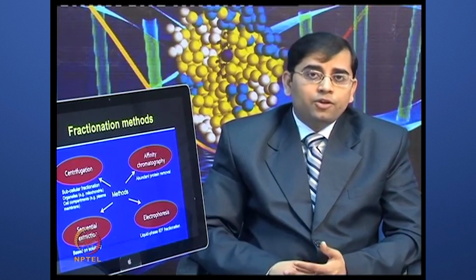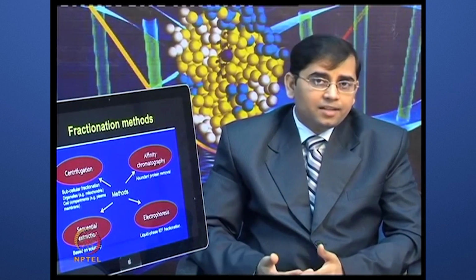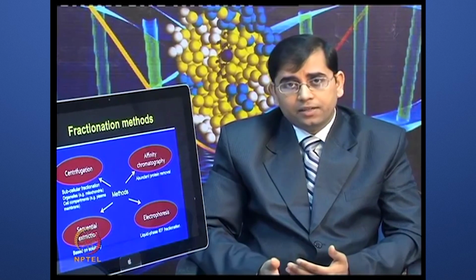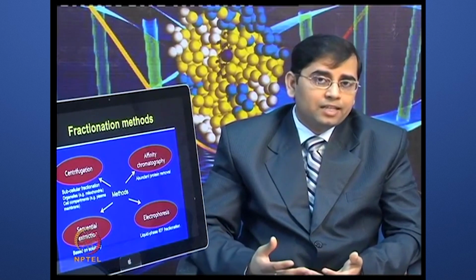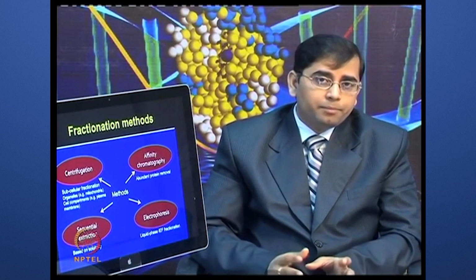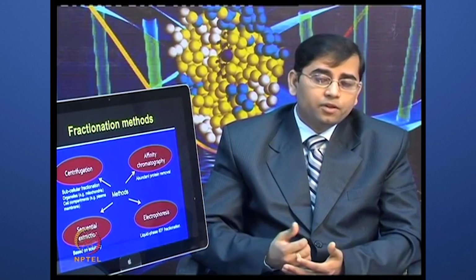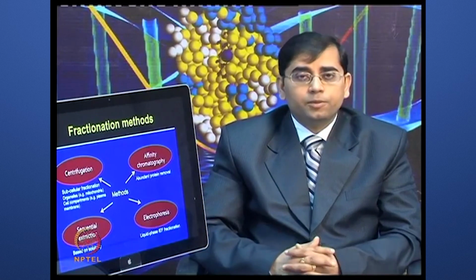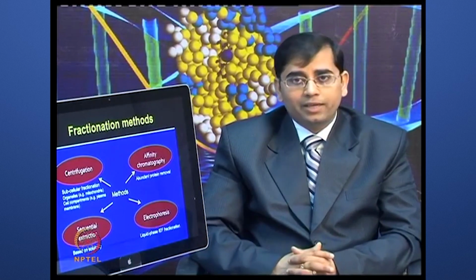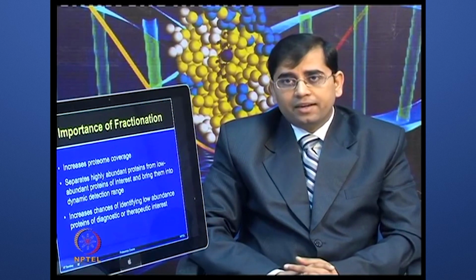In the next lectures, when I talk about specific types of gel-based and gel-free techniques, I will describe a new method being used, off-gel fractionation, which simplifies the step of isolating proteins, separating proteins based on their isoelectric point in liquid phase. One can collect fractions of different isoelectric point (pI) ranges and then perform the proteomic analysis. So, we have talked about different types of fractionation strategies.